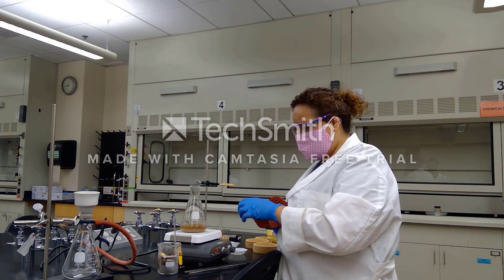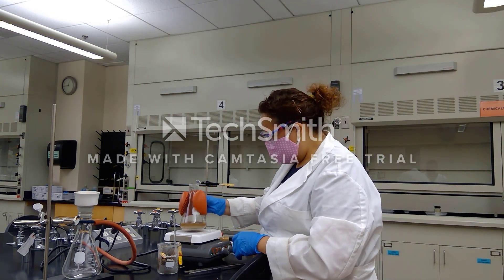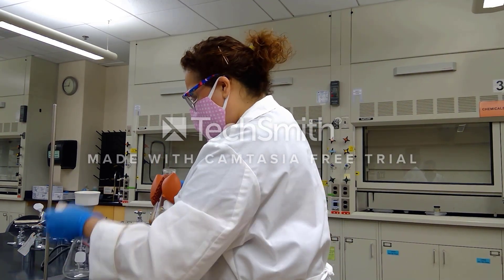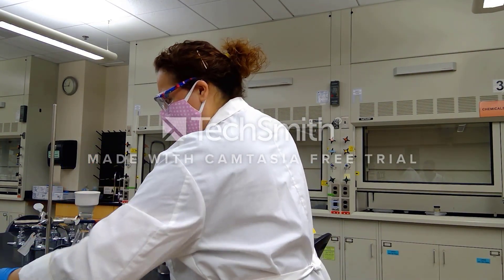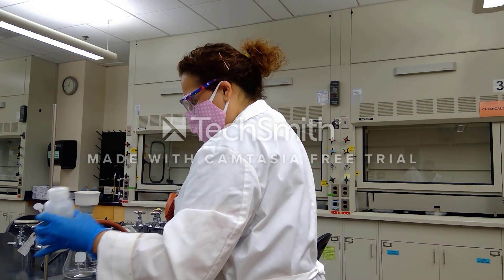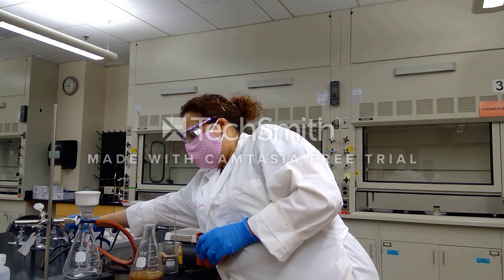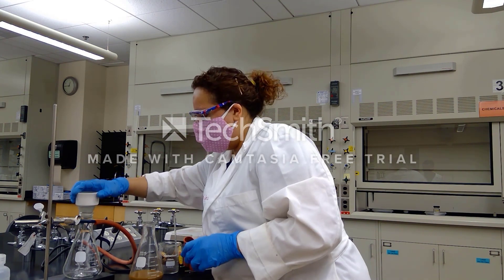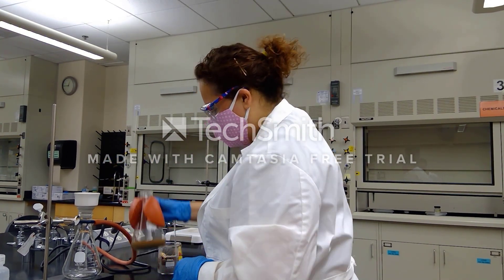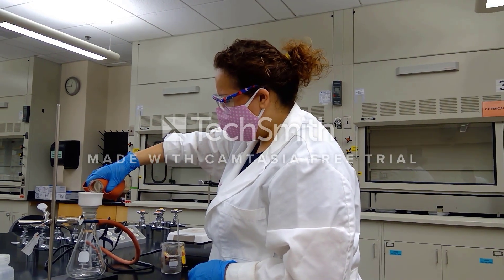Let's go ahead and get this filtered. We're going to give this a nice swirl and I'm going to add a filter to my Buchner funnel. As you always should, wet down your Buchner funnel just slightly with a little bit of water. I'm going to go ahead and turn on the vacuum and give it a twist just to ensure our vacuum is flowing, and lastly I'm going to give our compound just a little bit of swirl as we filter — going kind of slow.